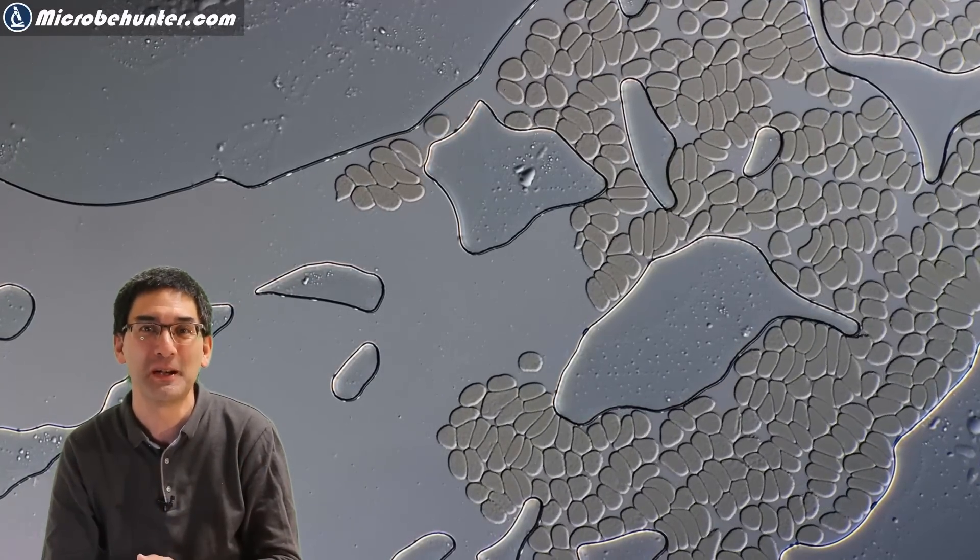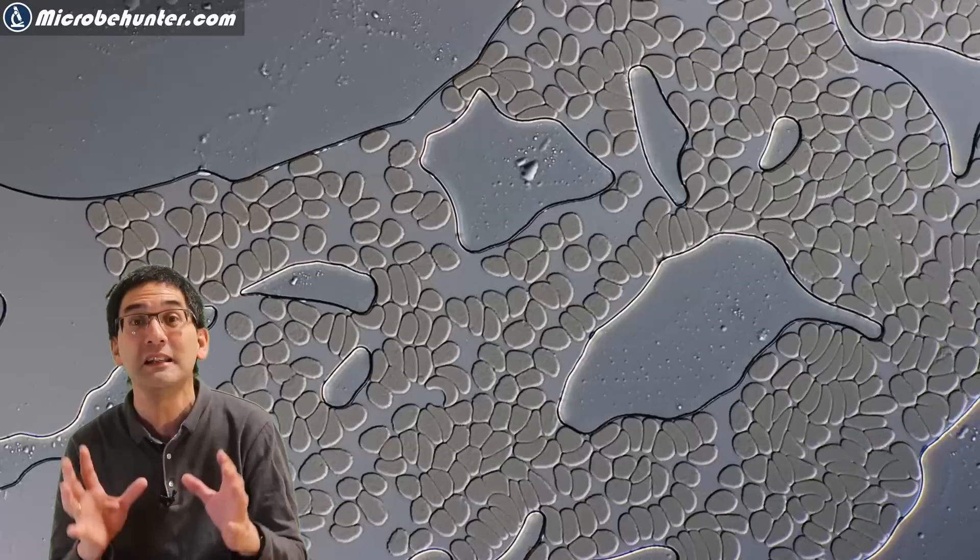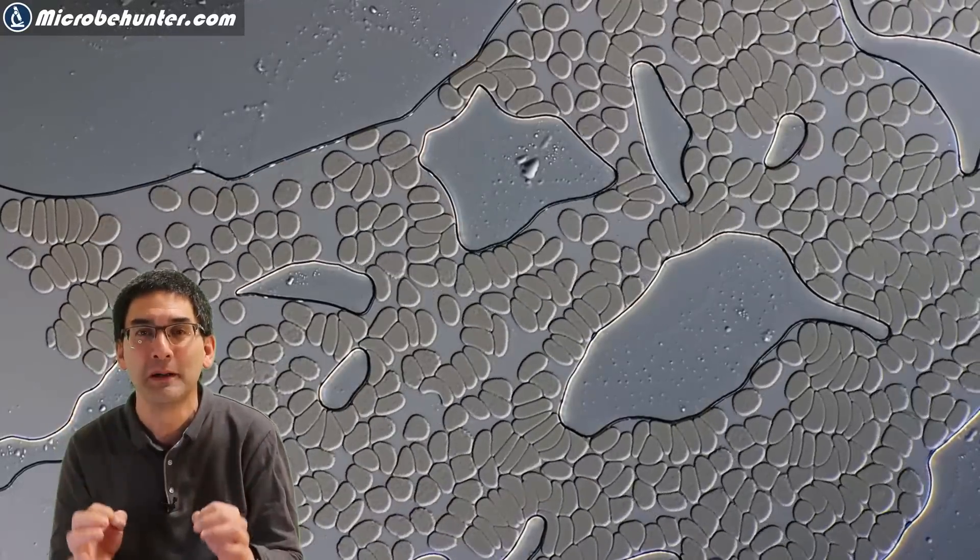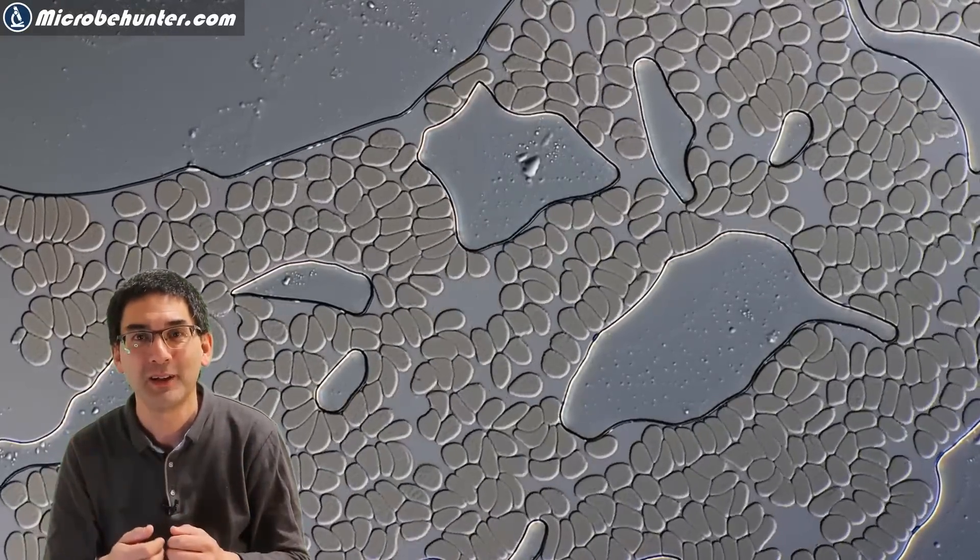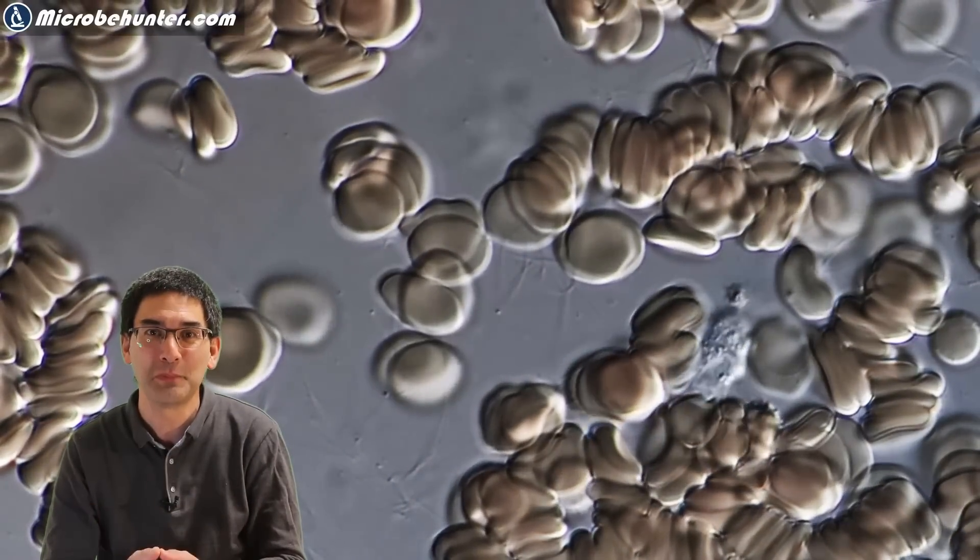In time lapse, I had to speed up the video quite a bit. You can see that they indeed move around like little amoeba, and it's actually quite a fascinating thought to think that there are billions of these cells in our body taking care that we do not become ill.